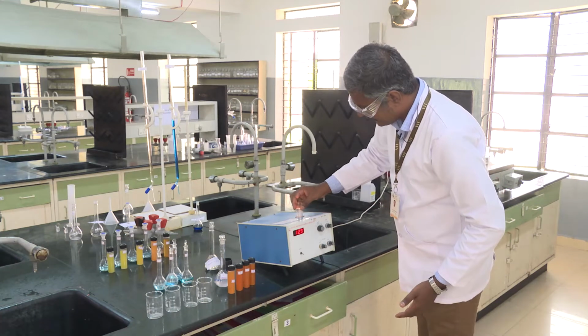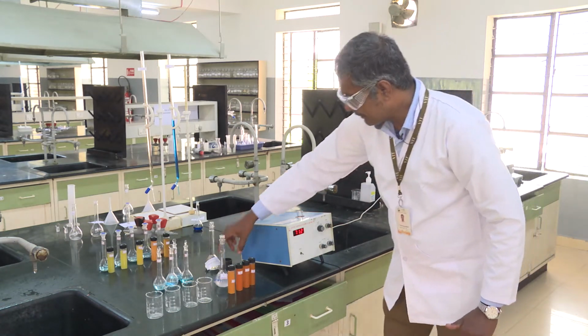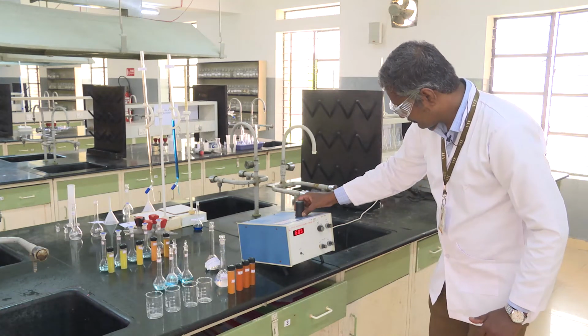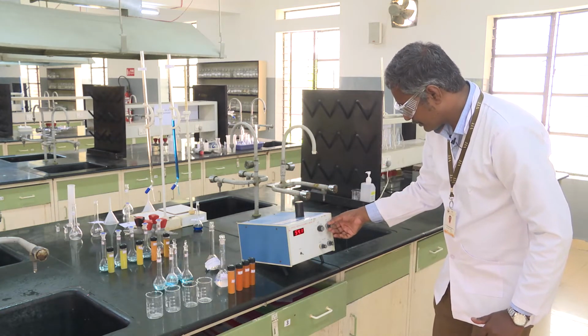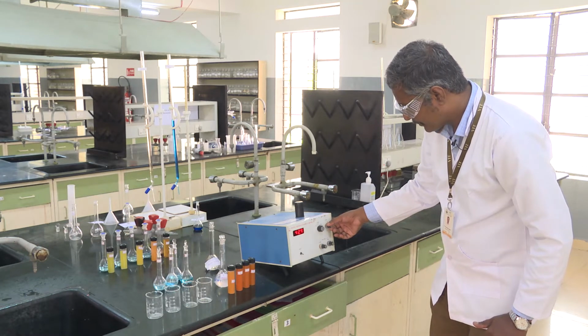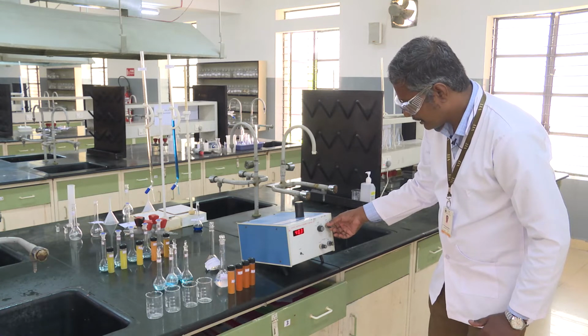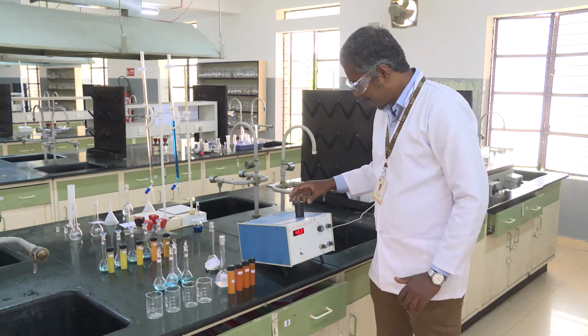I will put it into the instrument, cap it, and then calibrate to somewhere in the 40. It's ready to go.